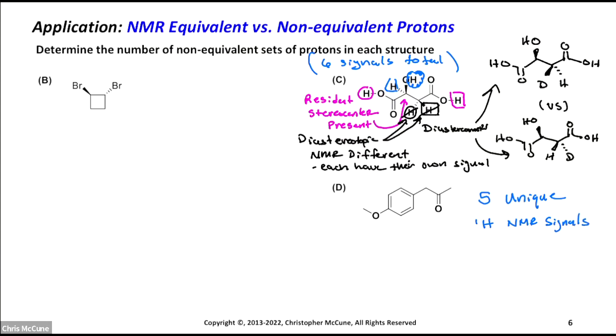Five. So I'll let you figure out why. If you can see it, great. And if you can't, then do the deuterium replacement test.